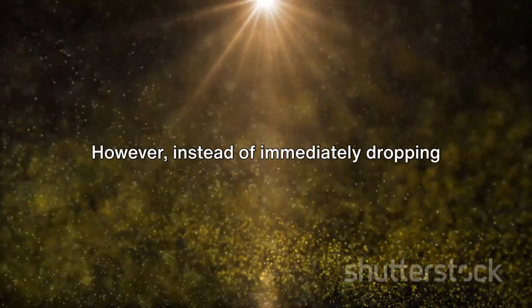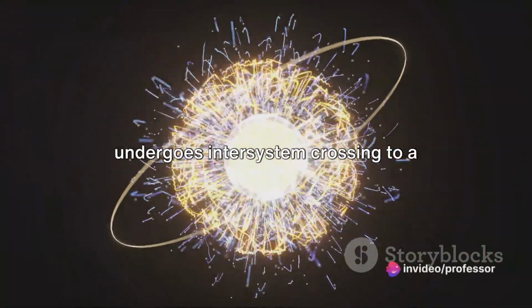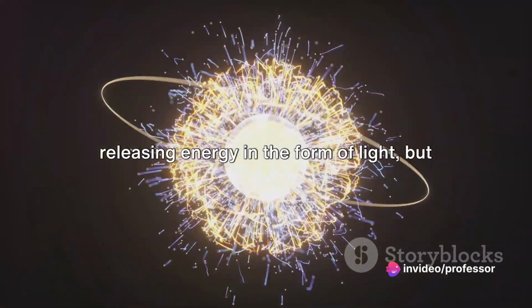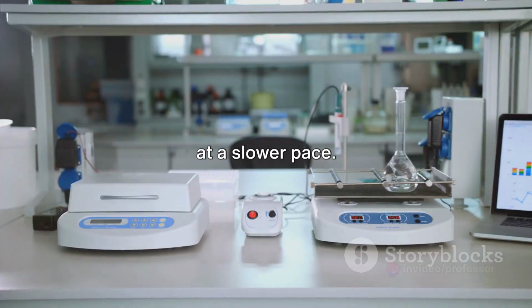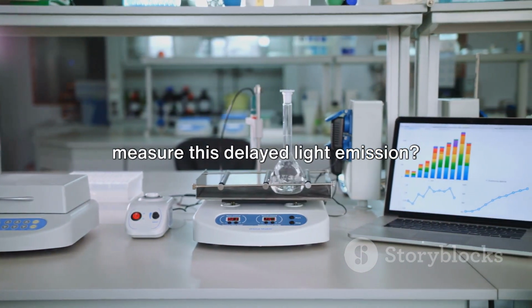However, instead of immediately dropping back to the ground state, the molecule undergoes intersystem crossing to a triplet state. It then relaxes back to the ground state, releasing energy in the form of light, but at a slower pace. Now the question arises, how do we measure this delayed light emission?